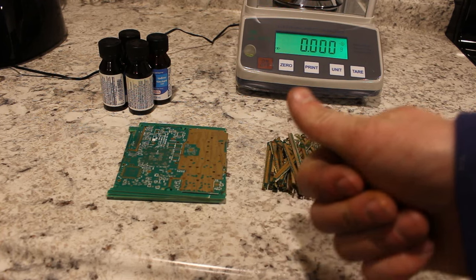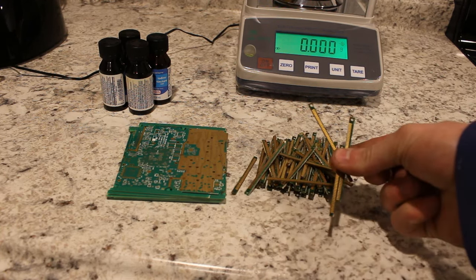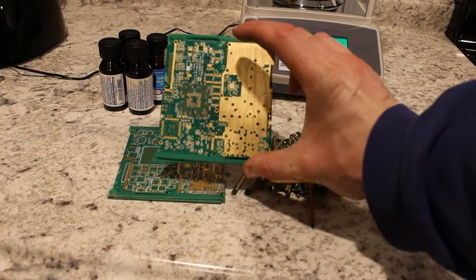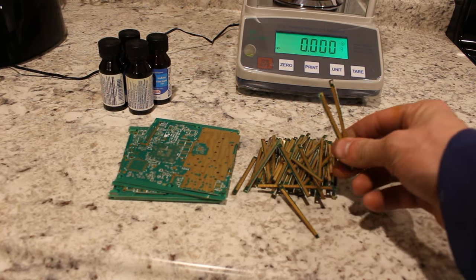Hi everyone, welcome back to Cody's Lab. So today we're going to be refining gold off of some of these actual computer parts. These are RAM fingers and some sort of circuit board here. They're both coated in gold and today we're going to be extracting it.